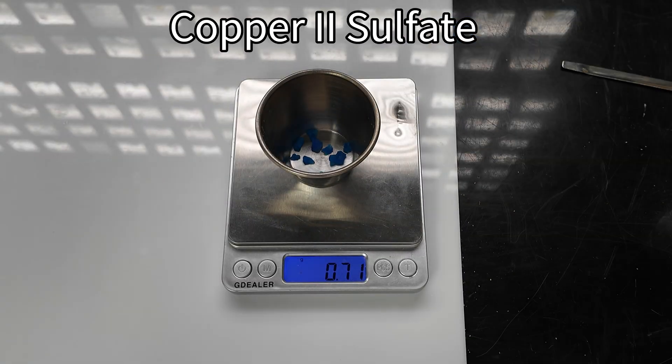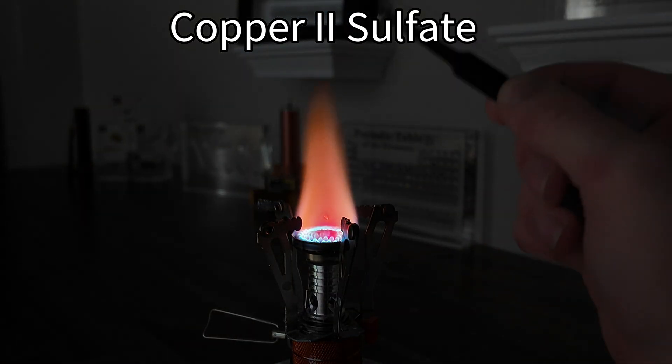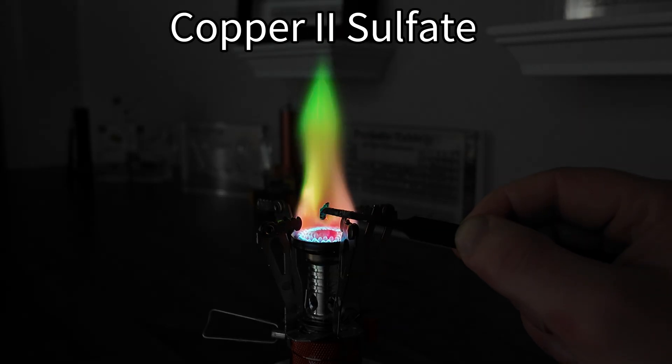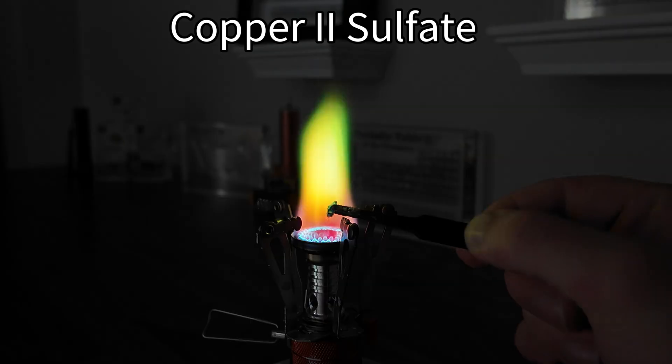Next up, we have copper-2 sulfate. You can use a Bunsen burner for every one of these chemicals. Some of them are easier to see inside of the crucibles, but some of them are easier to see in the flame of the Bunsen burner.